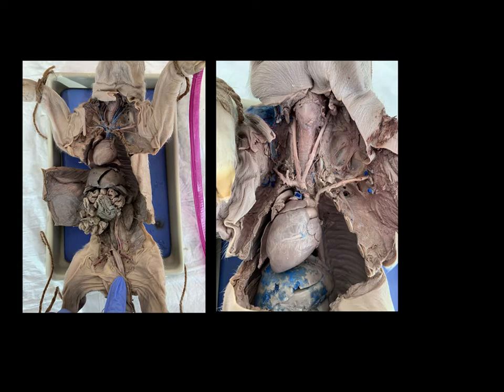Moving on now to arteries, we can see over here on the left again, this is still that dissected fetal pig. And over here on the right, what we're looking at is this area again, right here in the upper chest, neck area. But we've done something important. Remember those veins that we were just looking at in the upper chest, neck area? They're covering a lot of the arteries. So in this image, we've actually dissected those veins out. Here is that superior vena cava, and we've cut and removed all of that vein vasculature so that we can see the arteries that are hidden.